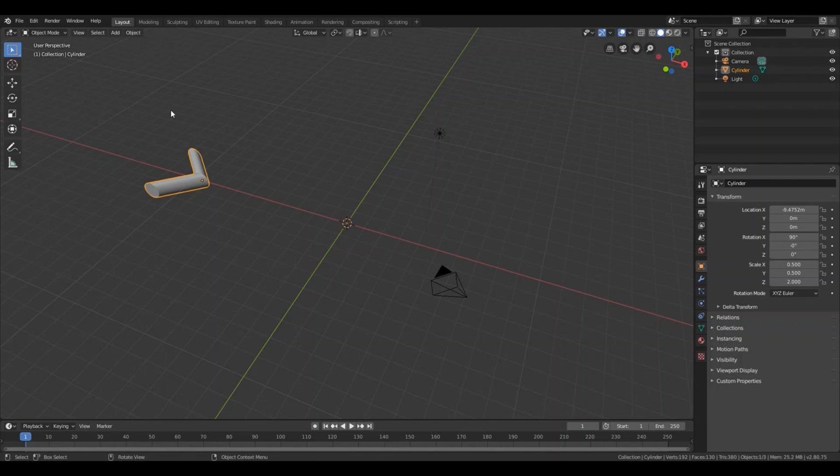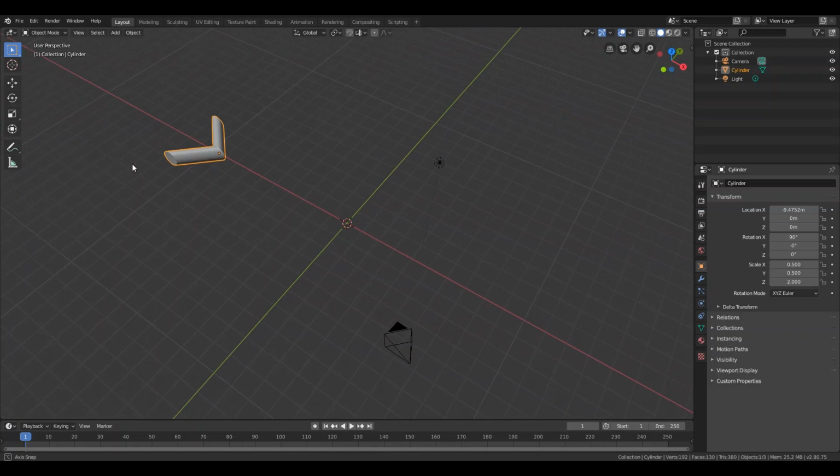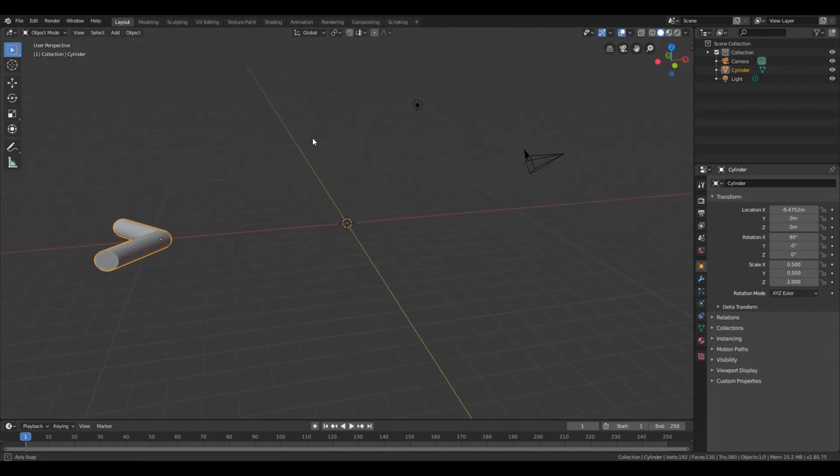And later one changed it to a lanthanum hexaboride crystal, or LaB6. Later again one changed it to a field emission source, whatever that is. So that is a cathode. So this here will send out some power. So the electrons are generated there.